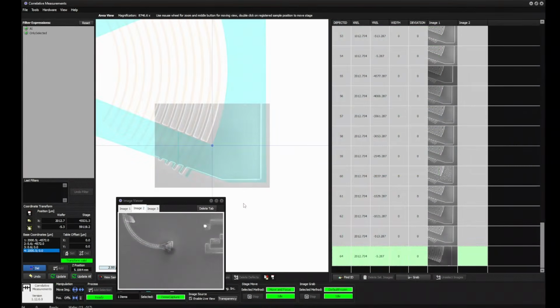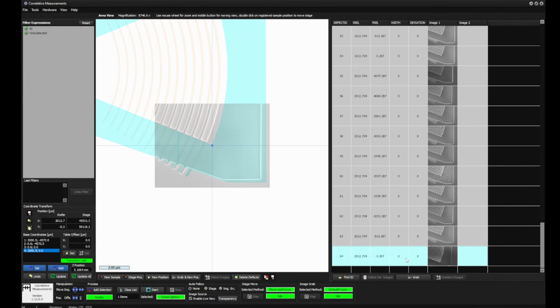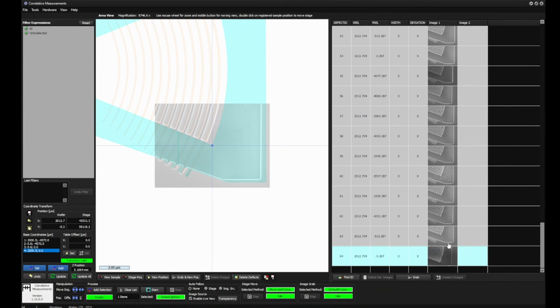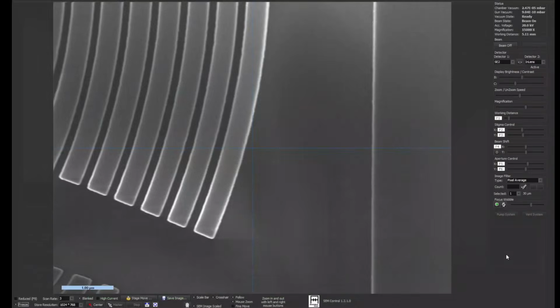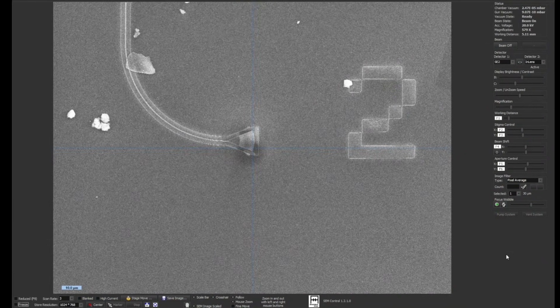Yeah. We are finished now, and we can see that actually the last image, strange enough, is not in the center, where the others are actually quite okay, I would say. Yeah, the large image not. We can have a look why this happened there. Let's go just to this position, then switch to the SEM and see. Yeah.